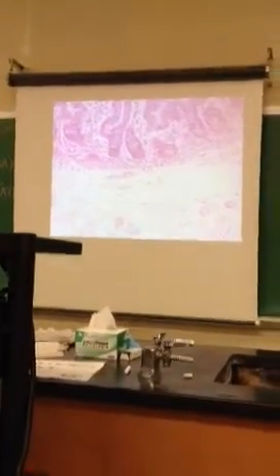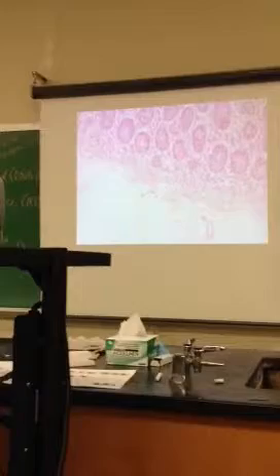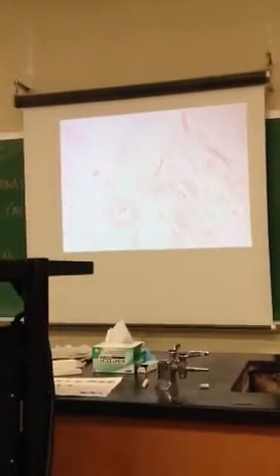muscular mucosa. It kind of looks like smooth muscle there. It's better in some places than others. It's a little bit better, but not stellar. All this, submucosa. And then we're back down to the circular and longitudinal of the muscularis externa.